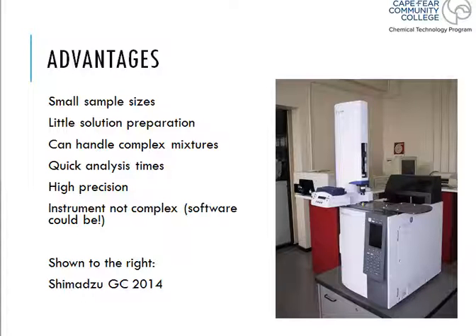All right, so this is where we left off, and we were talking about the disaster of Agent Orange and how the GC world would be perfect to analyze those types of samples to measure and monitor the TCDD levels or dioxin levels or any type of environmental concern. The problem, though, is that, like we said before, many times in a laboratory, we do not get a very clean sample, right? We always get these mixtures of samples, and the mixtures of samples have to be separated.